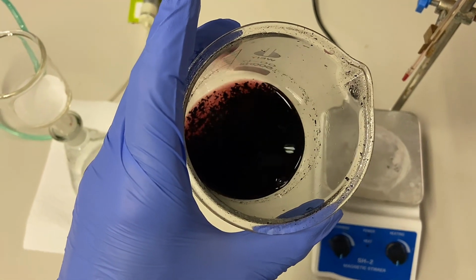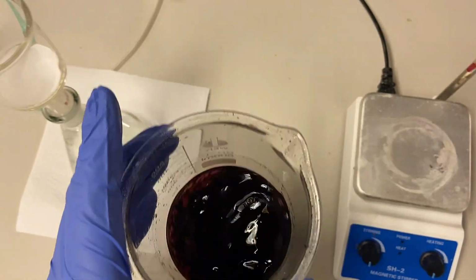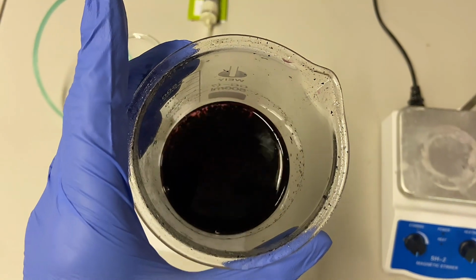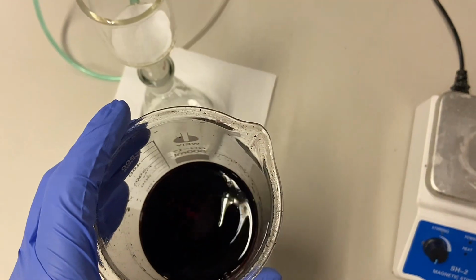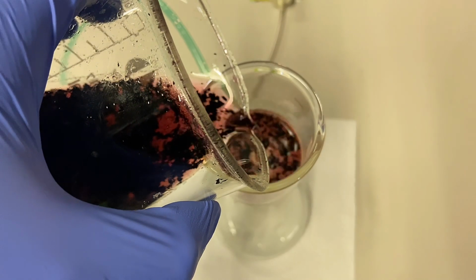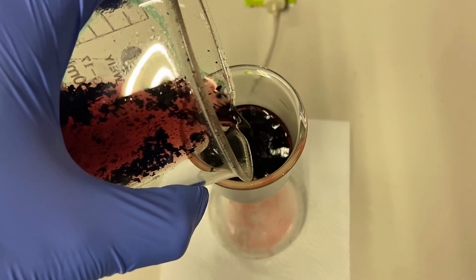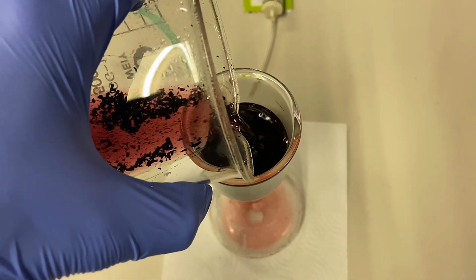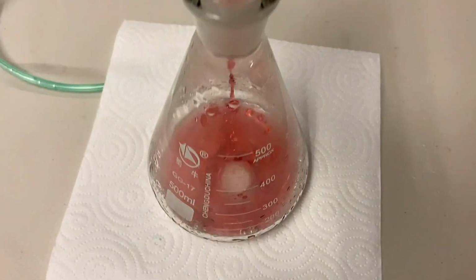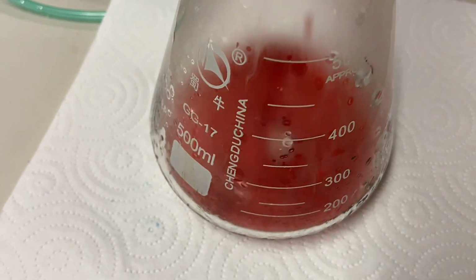There's enough red in the solution that I'm pretty confident I've got at least some of everything that I'm looking for. So the next step is to filter this off, get rid of any of the excess black mass and graphite, and really move on to the next step once I've got a nice, clean, filtered solution. Yeah, you can see a lot of the black mass is still in there, which isn't great, but again, there should still be enough that I can move on to the next stage. And yes, you can see a nice clear red liquid coming out the bottom, which is exactly what I want.